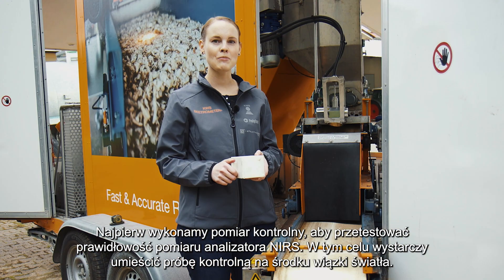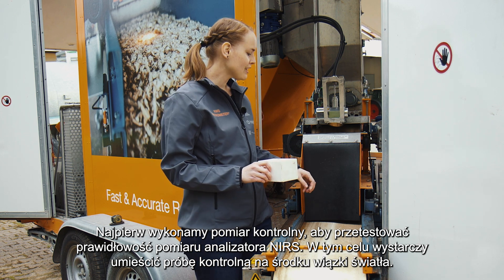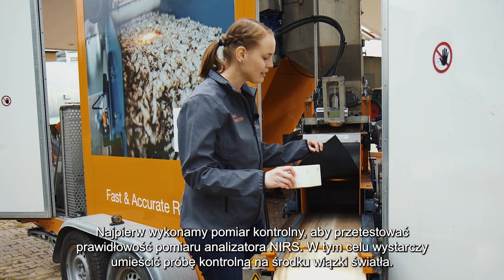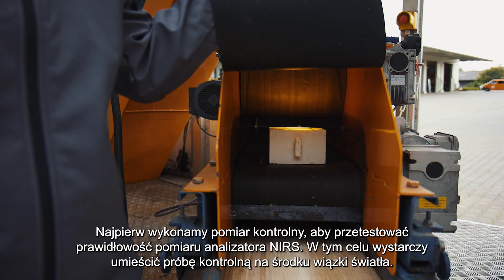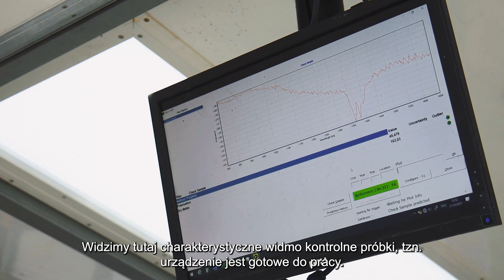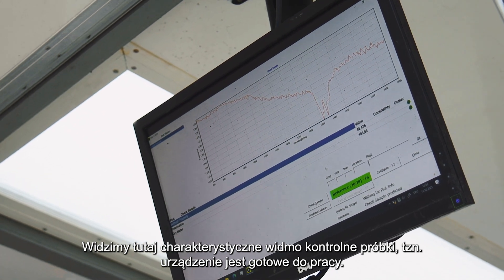First, we do a check sample measurement to initially test the NIRS unit. All we have to do for this is to place the check plate in the center of the light beam, and then we can start the measurement. We see here a characteristic check sample spectrum which indicates that the NIRS unit is ready to use.